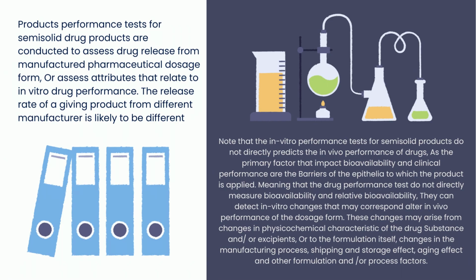The release rate of a given product from different manufacturers is likely to be different. Note that the in vitro performance tests for semi-solid products do not directly predict the in vivo performance of drugs, as the primary factors that impact bioavailability and clinical performance are the barriers of the epithelium to which the product is applied, meaning that the drug performance tests do not directly measure bioavailability and relative bioavailability.